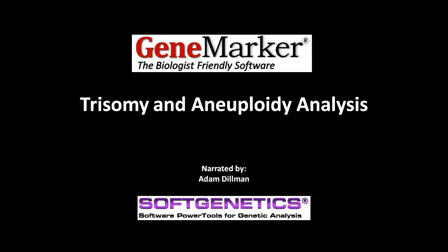Hello, my name is Adam Dillman. In this webinar we will be covering trisomy and aneuploidy analysis of QF-PCR data using GeneMarker software.